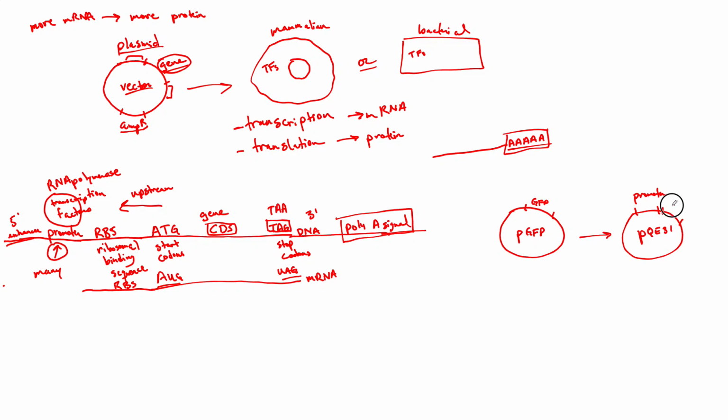So we're going to move this GFP gene to this plasmid, which already contains this promoter that's going to give us special control over the expression of GFP. And this plasmid, PGFP, that this gene is currently in, does not have that promoter. It does have a promoter, but it's not the one we want.